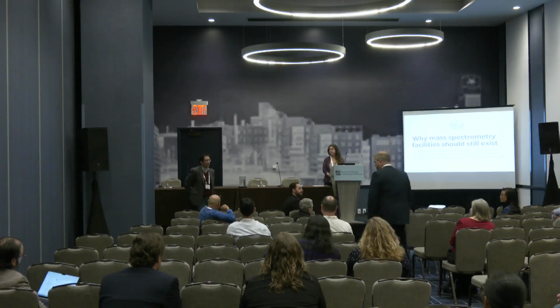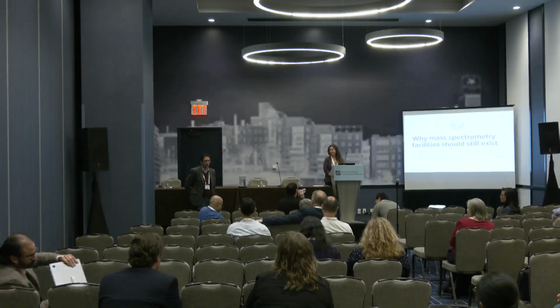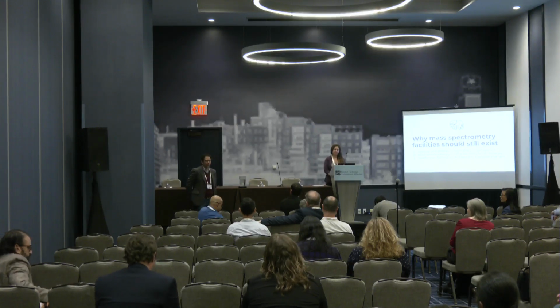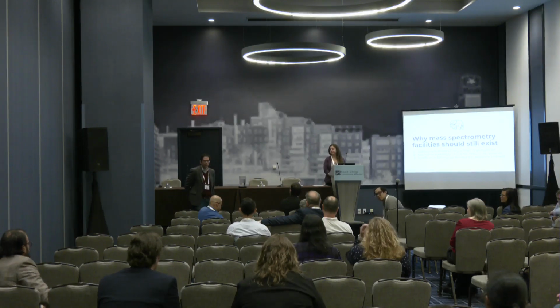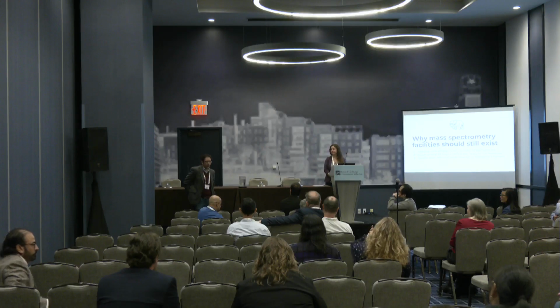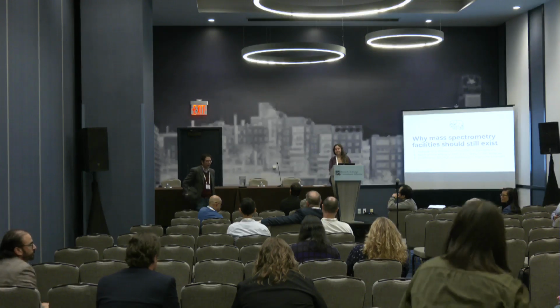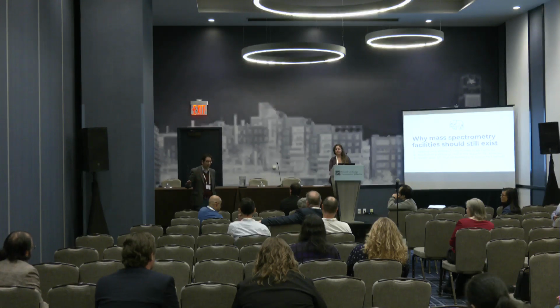Okay, so again, as we've been talking about, we don't know what these molecules are binding to in many of these affinity assays, right? And so to use one in a clinical setting, I think would be terrifying, if we don't actually know what it's doing. And so from that perspective, I think that the vetting needs to happen at a very different level than just saying, can we get reproducibly the same number out, right? You can get reproducible binding to background, to a totally different protein. That doesn't mean that you're actually measuring the thing that you're interested in measuring, or that what you're looking at is an off-target effect, right?